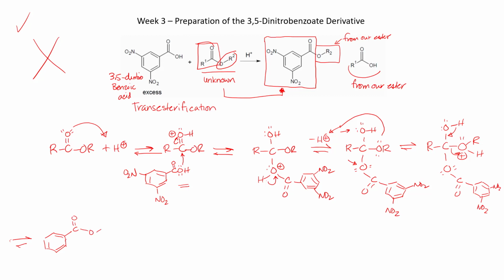And I will end up with this compound initially. Now remember, that right there is my R group in the original molecule.